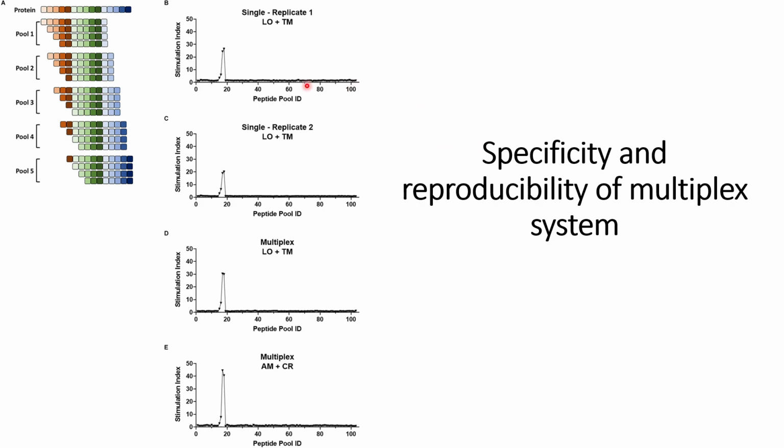So when the T cells get activated, NFAT gets dephosphorylated in the cytoplasm, and this dephosphorylated NFAT then localizes into the nucleus, where it helps the transcription of the plasmid, as the plasmid contains the 8 NFAT binding sites.